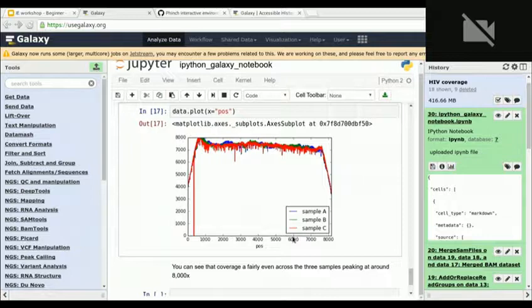But at the end of all of these branches, you eventually end up with these leaf data sets which you need to interpret. It's not something you can publish. You're publishing the leaves. So to get from these intermediate branches to the leaves, you will need that. And what Jupyter integration in Galaxy does is bring it all into one place, and you can play with the data at Galaxy infrastructure's expense, which is great. That's a simple example of real data. More sophisticated examples, for example.